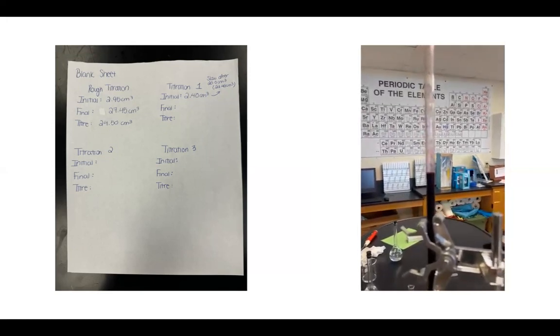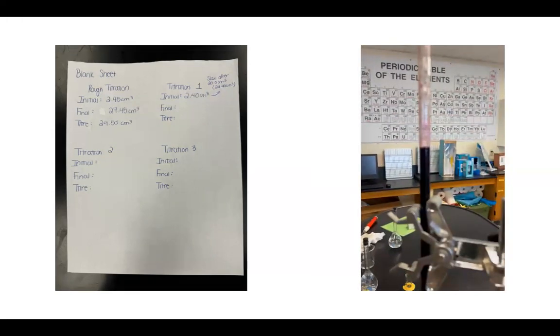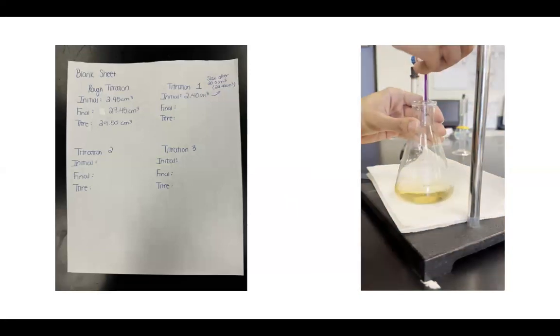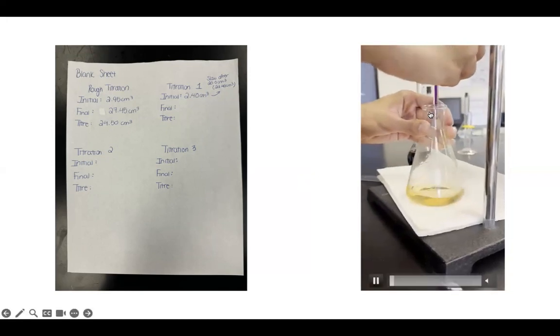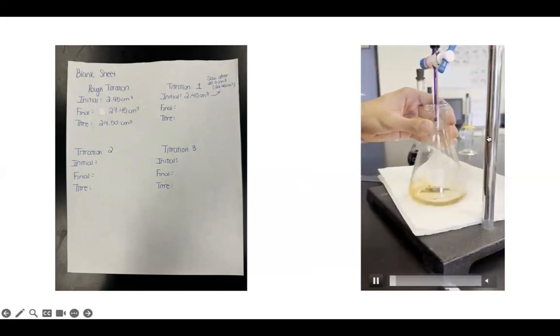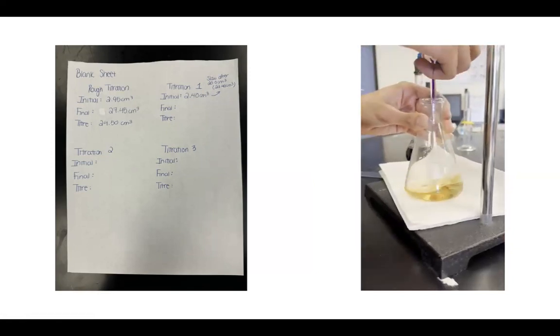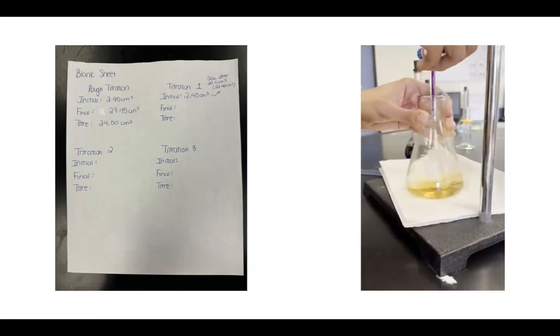Again, this is all thanks to the rough titration and that we know roughly how much we need to add before the color change starts to begin. After you've done that, you're going to have to go very slowly, drop by drop, and maintain a steady stream. So you slowly open the stopcock so that you get a drop by drop stream. Be very careful because sometimes they go very quickly. You just got to keep a steady hand on that, and remember to swirl constantly. If anything gets on the rim of the conical flask, you can use distilled water to wash that off.